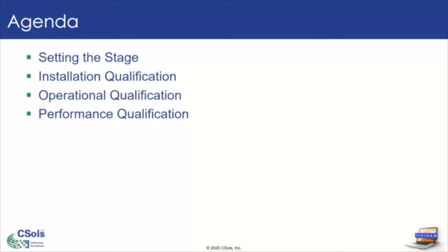And then I will take a little bit of time, during the rest of the presentation to go through IQ, OQ, and PQ, each separately. For each section, what I'll do is go through a little bit of the more specific background for each of the testing types, talk about contents, roles, responsibilities, touch on some pitfalls, some lessons learned that we've had for each, so you get a real good picture of what is required for each of these and what you need to be aware of. And then it's not on here in this agenda item, but at the end I'll circle back around and give some summary slides and some tips going forward.